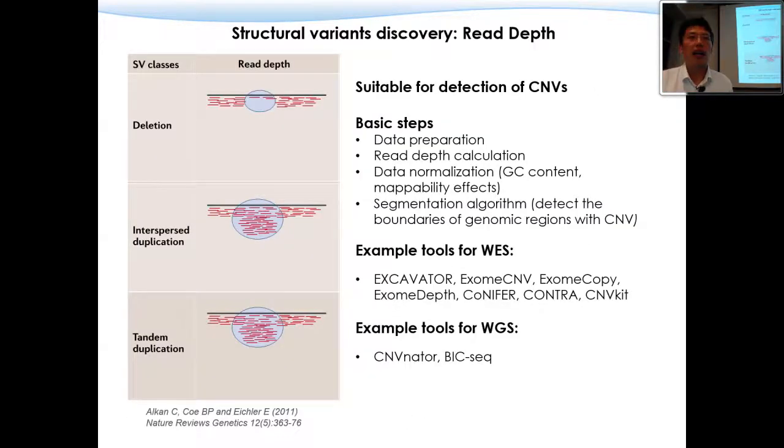So when we look at the deletions, there might be some reads which might be split. Yes. There's a region which is deleted, so some part of the read is on this side and some on the other side. Yeah, absolutely. This is one type of information people can use. That doesn't mean this is the only information you use.